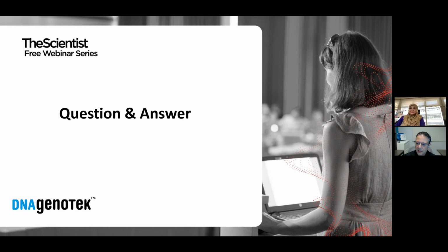Dr. Masita, do you have data regarding the percentage of saliva swab saliva tests needed to proceed with blood tests for HLA? Yes, we have. At the moment, we notice that less than 3% of our DNA extracted from the saliva cannot run the test, so we need to take from the blood. Less than 3%. Perfect. Thank you.